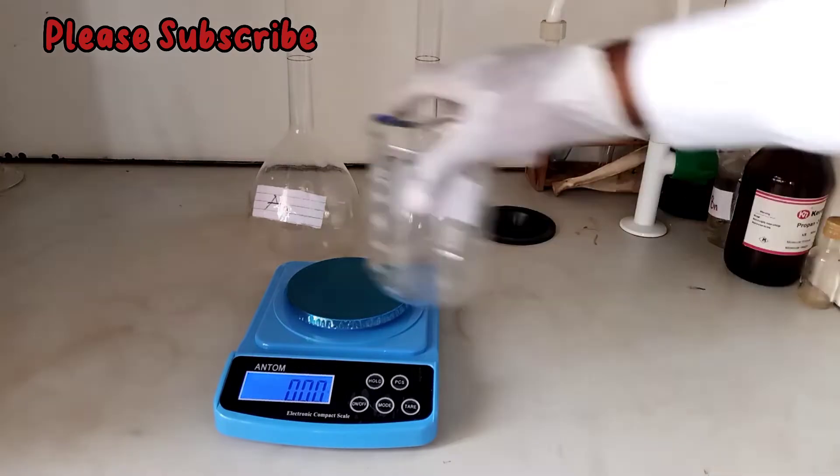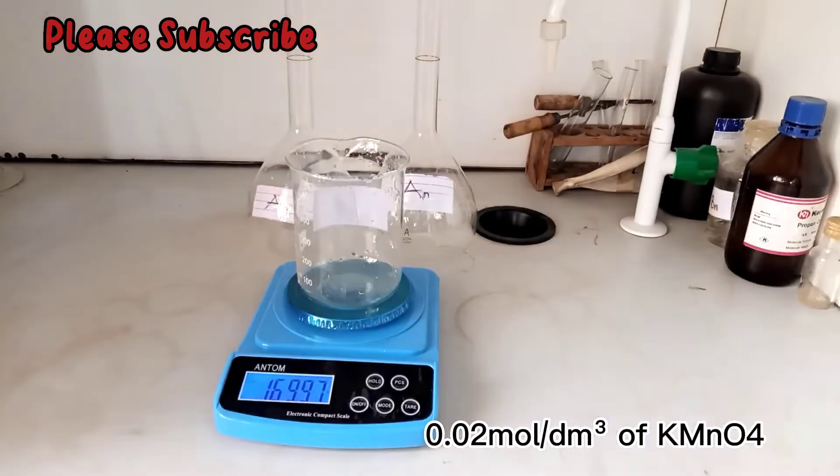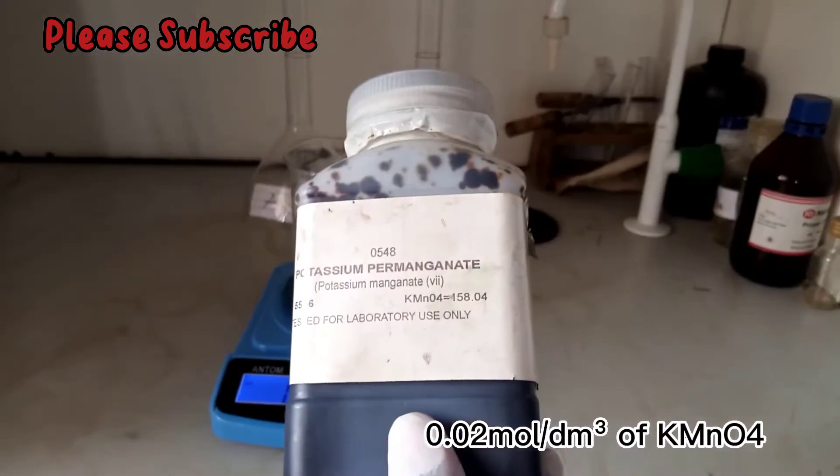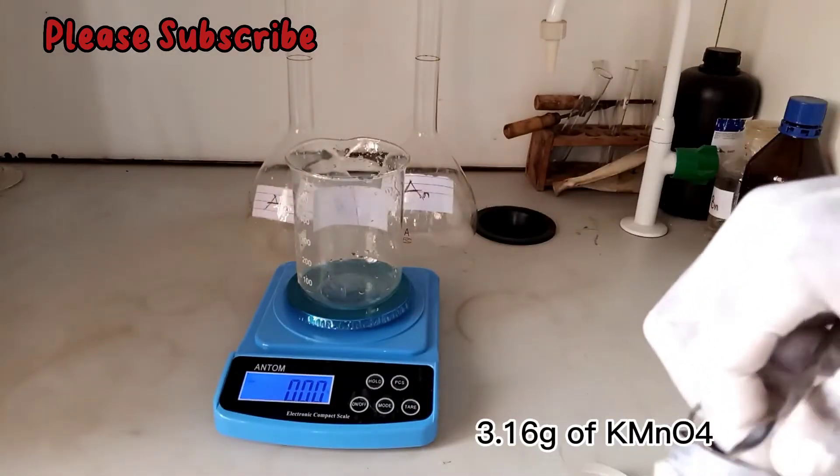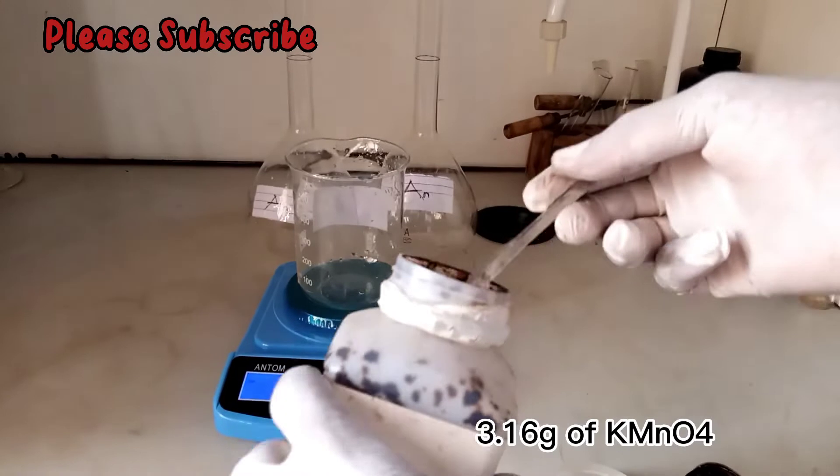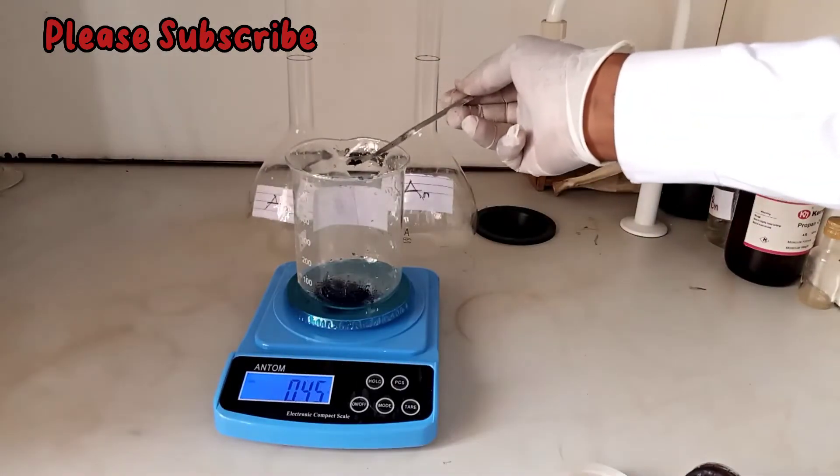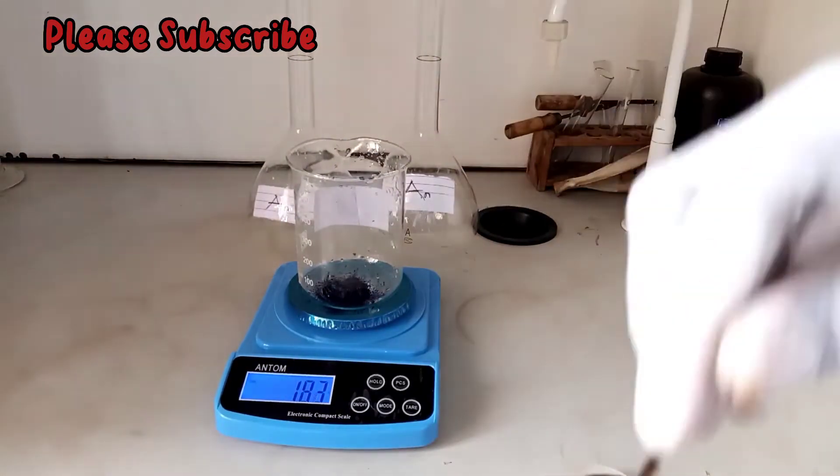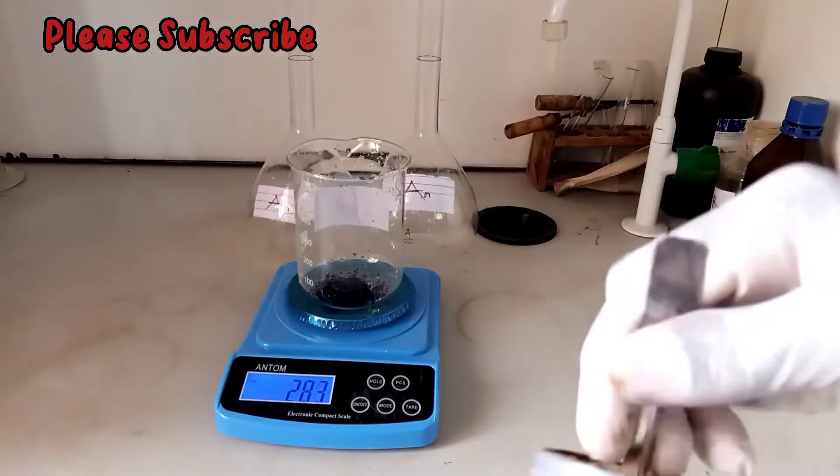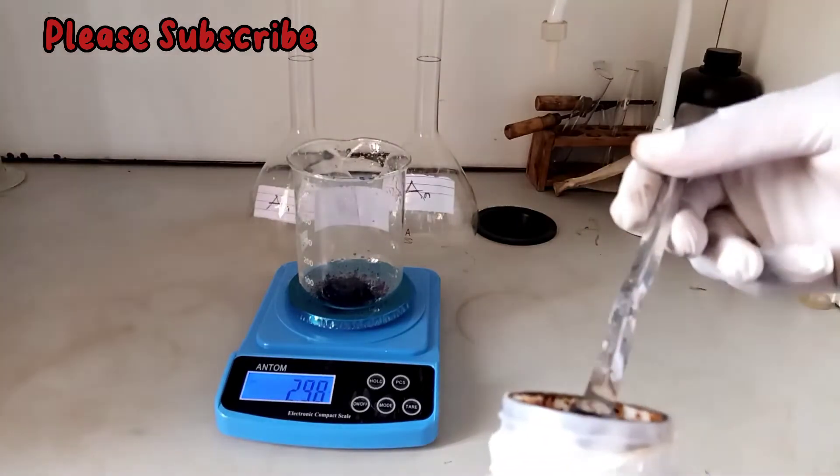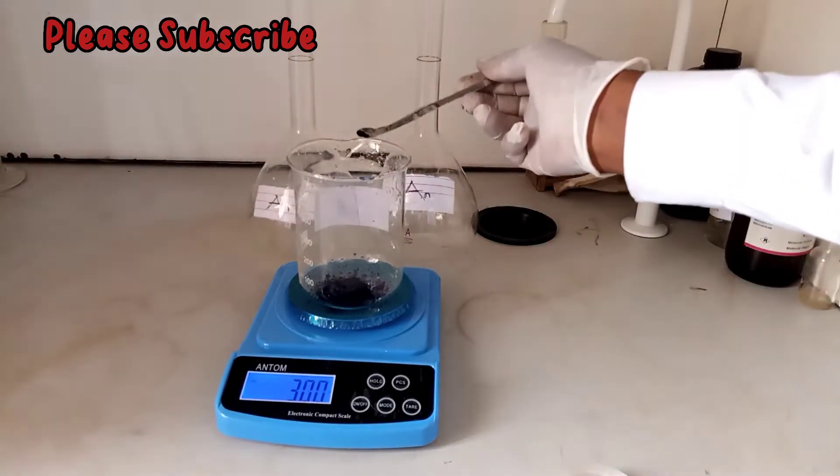We'll start with the preparation of 0.02 mole of potassium permanganate per dm³. First you weigh out 3.16 grams of potassium permanganate.